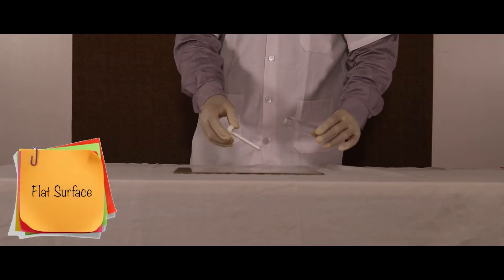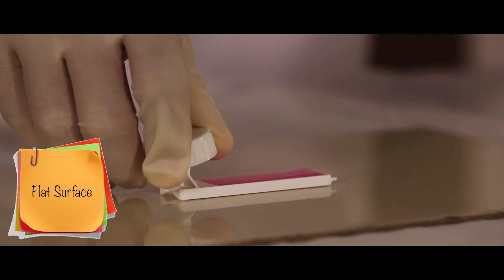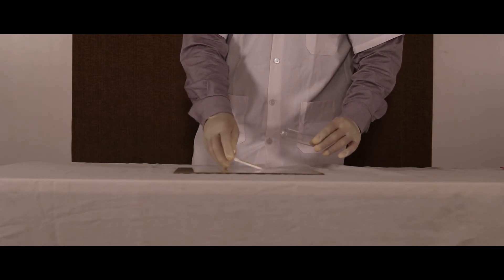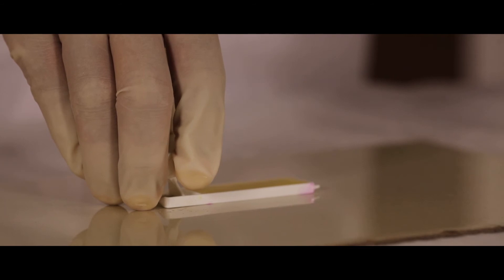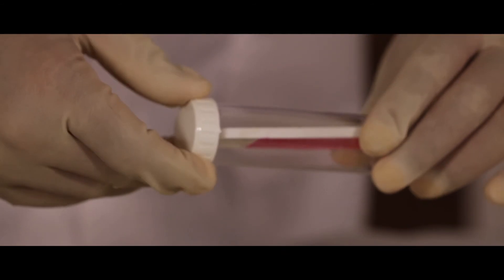To check the bacteria present on a flat surface, open the slide and place it on the flat surface, then press the cap until a click sound and the slide touches firmly on the surface. Repeat the same on the other side and screw it back into the tube. Allow it to incubate for 18 to 24 hours at room temperature.